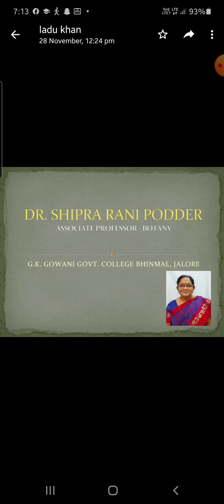The palisade is a single continuous layer of columnar cells. The spongy parenchyma consists of several layers of loosely arranged oval or irregular cells that are confined to the wing. The cells of both the palisade and spongy parenchyma are rich in chloroplasts.